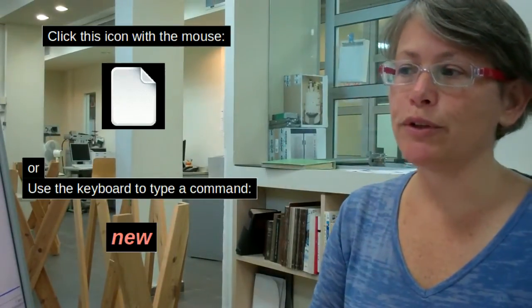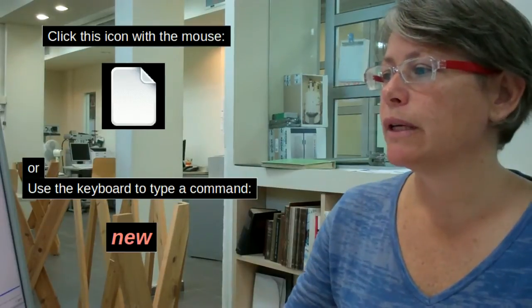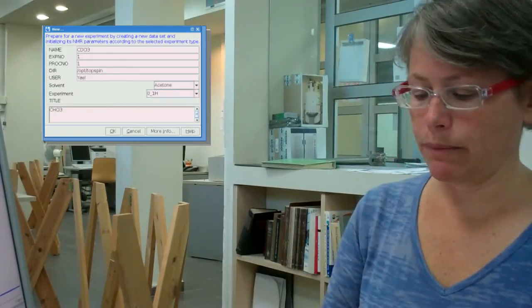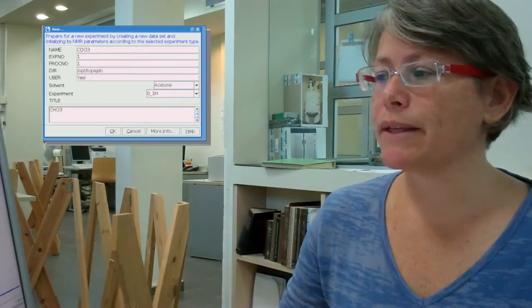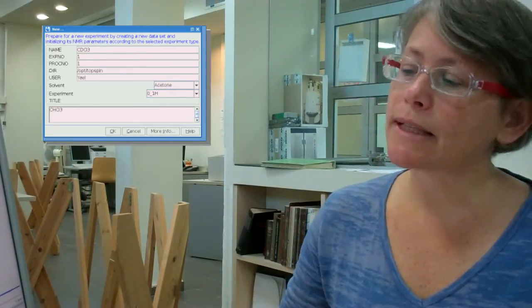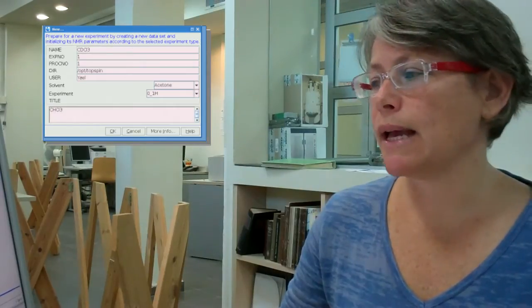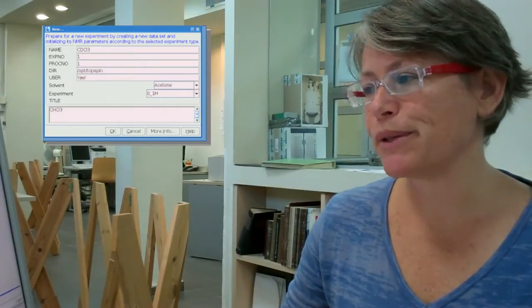Step 2 now is to create a new file. Either type new or click on the icon new. And here for name, I'm going to put my name, followed by a 200. That's to help keep me organized that I'm on the DPX200. The experiment number is 1. It can be any integer value, but no symbols, no letters.